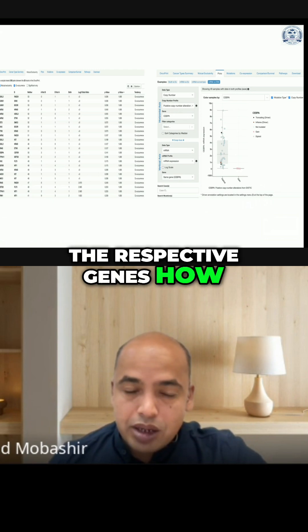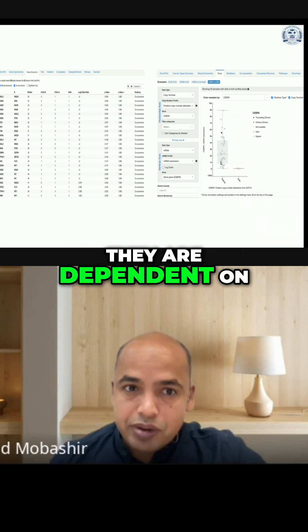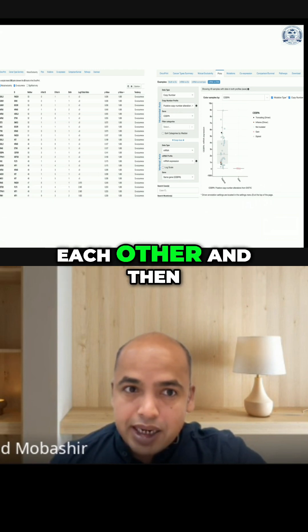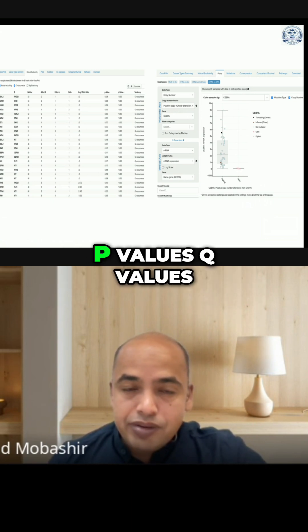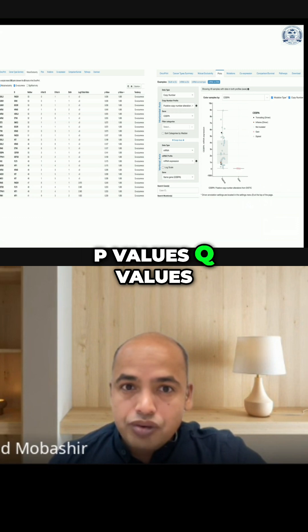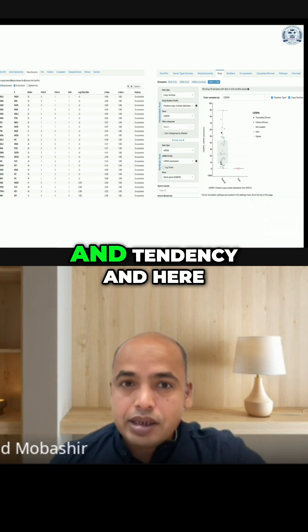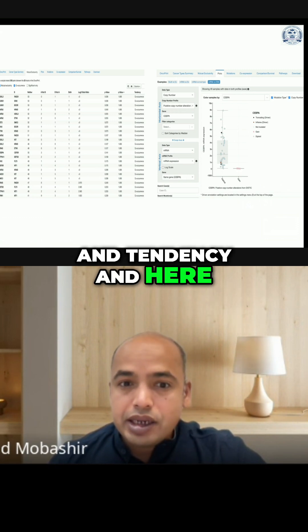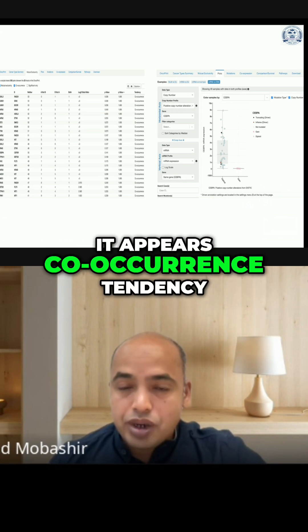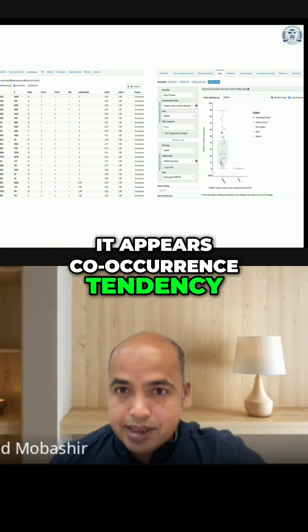The respective genes, how they are dependent on each other, and then you can see the p-values, q-values, and tendency. Here it shows the co-occurrence tendency.